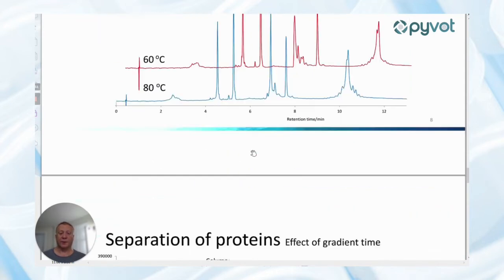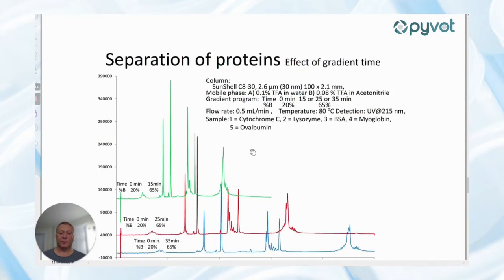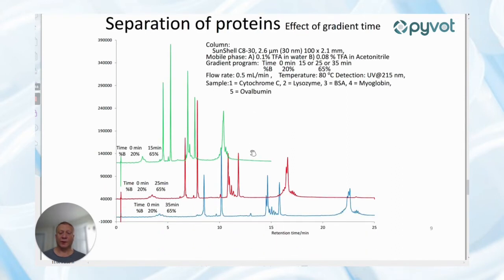Now, taking the same separation condition and looking at the effect of gradient time. What you'll see here, and we're looking at the same protein samples, is that the longer the gradient time, the better the separation.